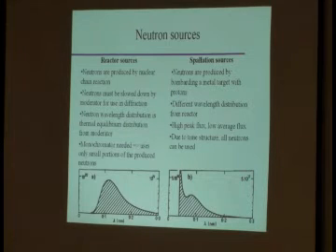What you now have is a bunch of detectors that do not only detect that the neutron hits them, but also when the neutron hits them. So what you do is a so-called time of flight experiment. You collect all the neutrons of all the different wavelengths, and you discriminate the wavelength by the time at which they arrive at the detector. Has the advantage that you can use all of the neutrons that you produce. You do not have to throw any of them out. So, much more efficient.